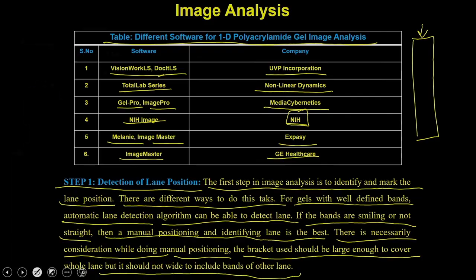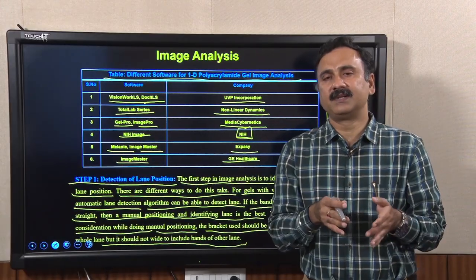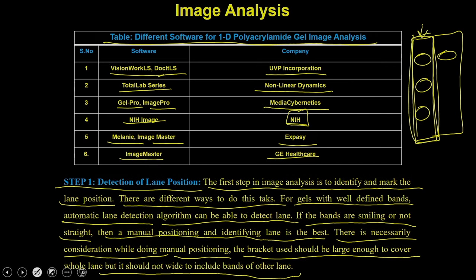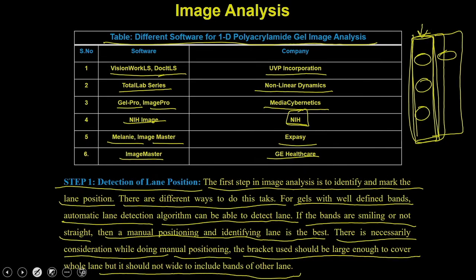So when you are doing the first step, you have to detect the lane in which you are interested to do the measurements. This has to be very precise so that it only detects lane 1. It should not take up the bands from the neighboring lane, which means if you have 2 lanes side by side, you can just select the lane you are interested to measure, but it should not be so big that you take up the band from the neighboring lane as well. So once you have done the detection of the lane position, then you go to step 2.